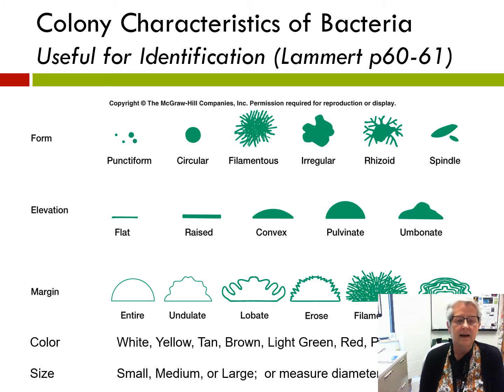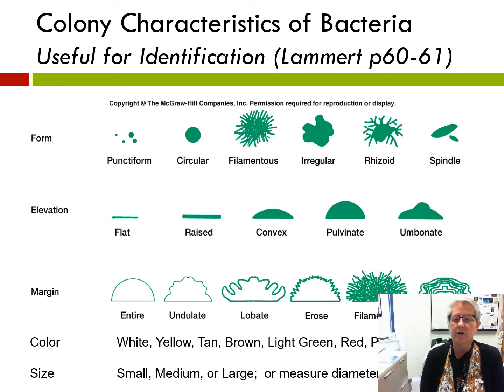You can see that colonies take different forms. Most common to us will be punctiform — they look like little dots — circular, and irregular.